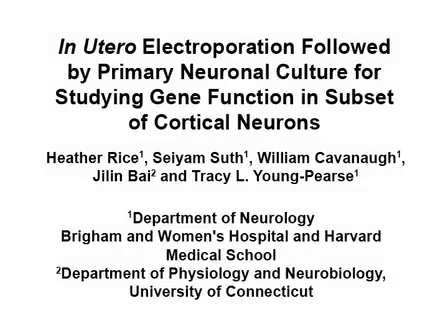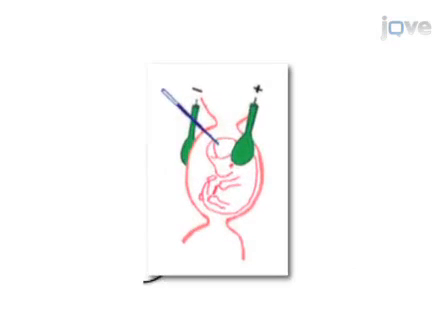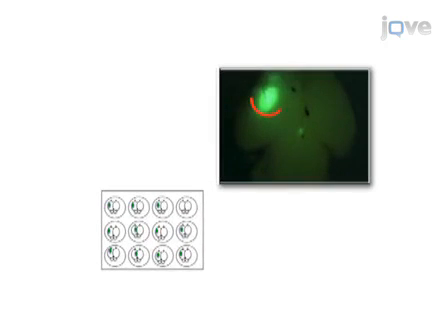The overall goal of the following experiment is to examine developmental effects of knockdown or overexpression of genes in specific subsets of neuronal progenitor cells in the neocortex. This is achieved by in vivo electroporation of DNA into rat embryos to transfect neocortical progenitor cells. As a second step, the electroporated region is dissected in order to enrich for transfected cells.